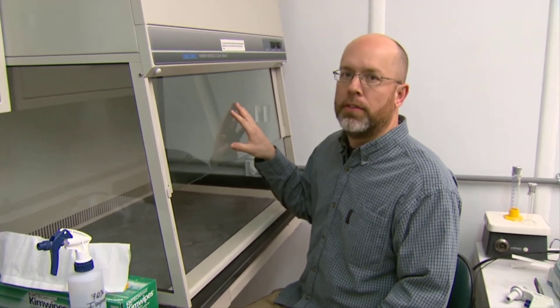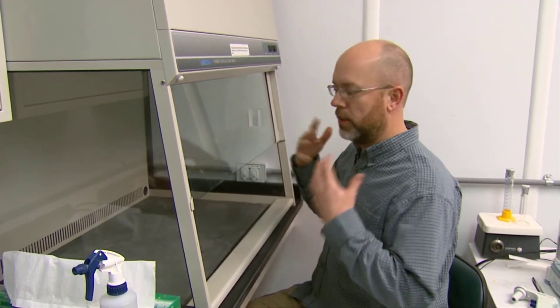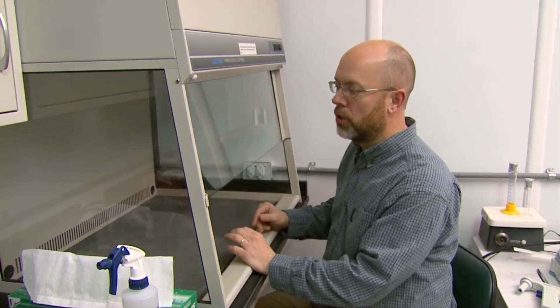It's important when working with algae cultures that you use sterile technique in a sterile environment — especially when transferring from one slant to another or from a slant to a flask culture. This is a laminar flow hood that works really well. Instead of a traditional fume hood that sucks air in, this blows air towards you so that no contaminants come from the air into the culture system.